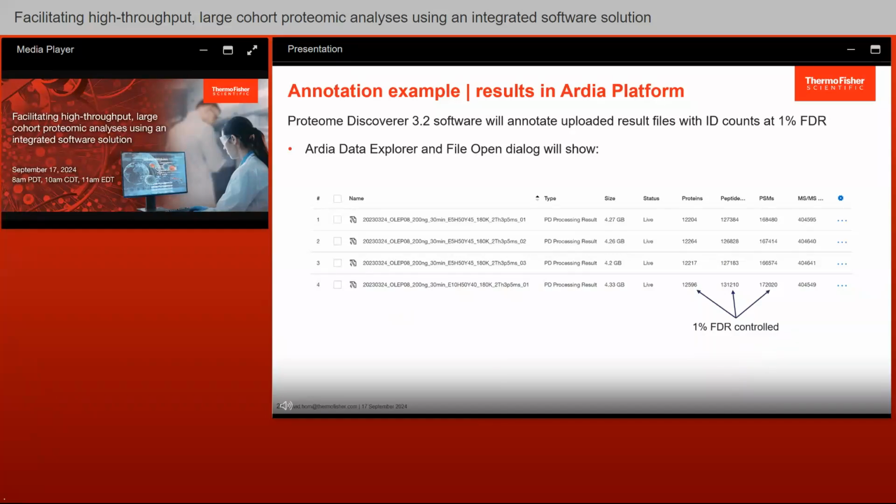These numbers can give you insight into the complexity of each sample and can help you catch issues with sample preparation or other aspects of the system if the numbers change substantially as data are being acquired.